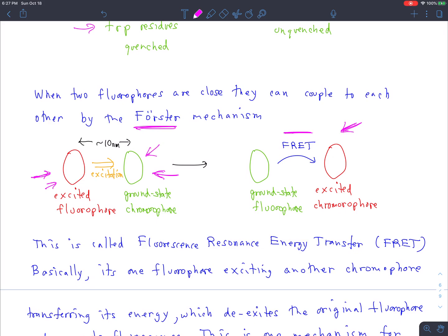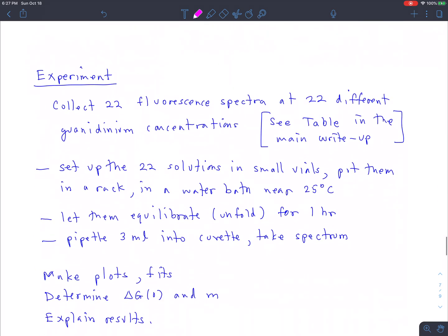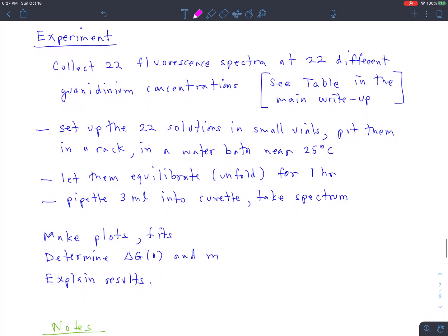Now, it isn't quite emission and absorption in the normal sense because it's really dipole interactions here. That's what the Forster mechanism is all about. But in essence, it's emission and reabsorption by close-lying chromophores and fluorophores within the single molecule itself. All right, so that's the sort of theory and background and goals.